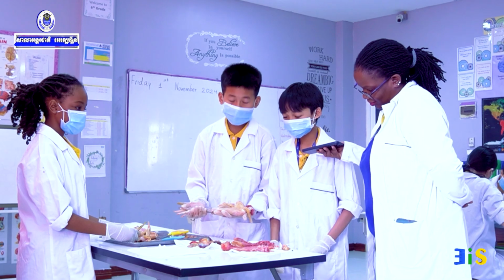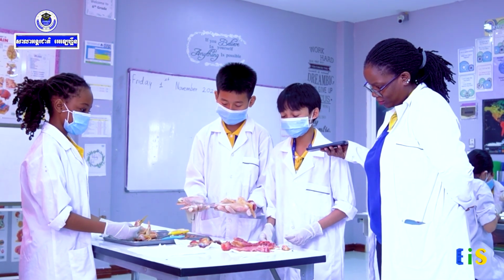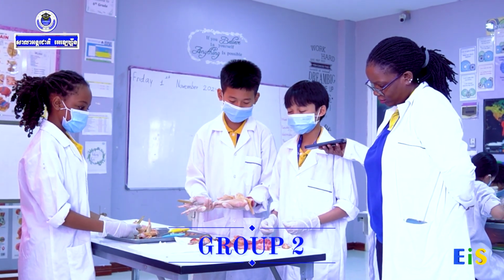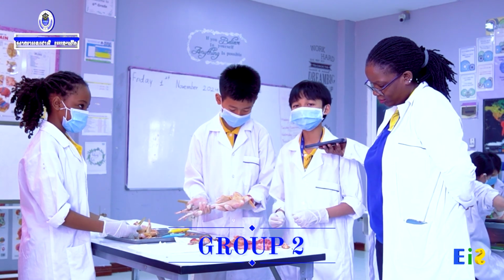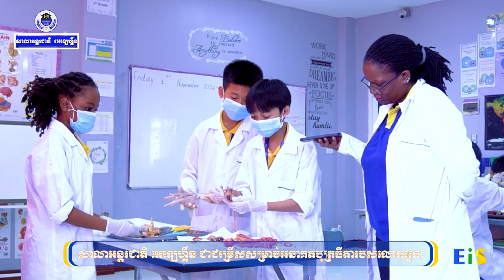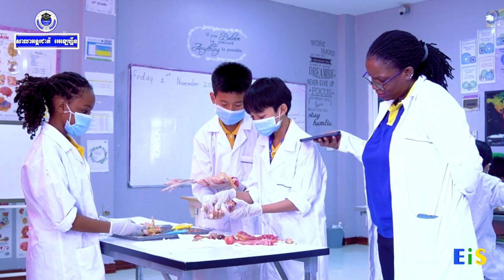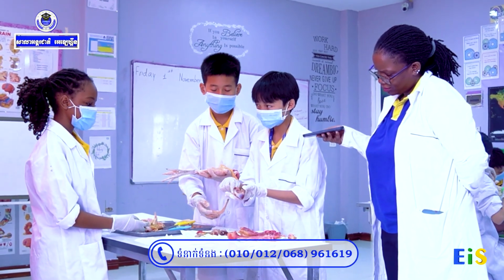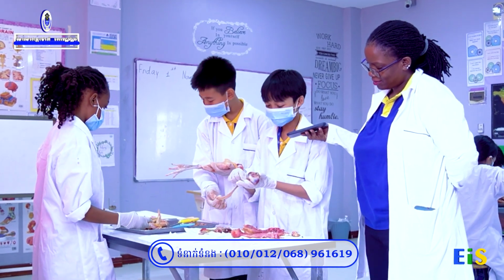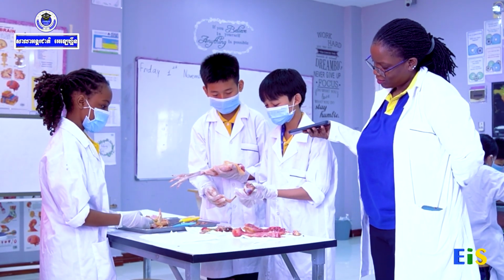Today we are going to conclude a science experiment on the internal organs. We have dissected a chicken, and we are going to look at its internal organs and show them to you. So first, this is the gizzard, which holds the trash that the chicken eats, and this is the stomach of it, and this is the esophagus where the chicken eats.